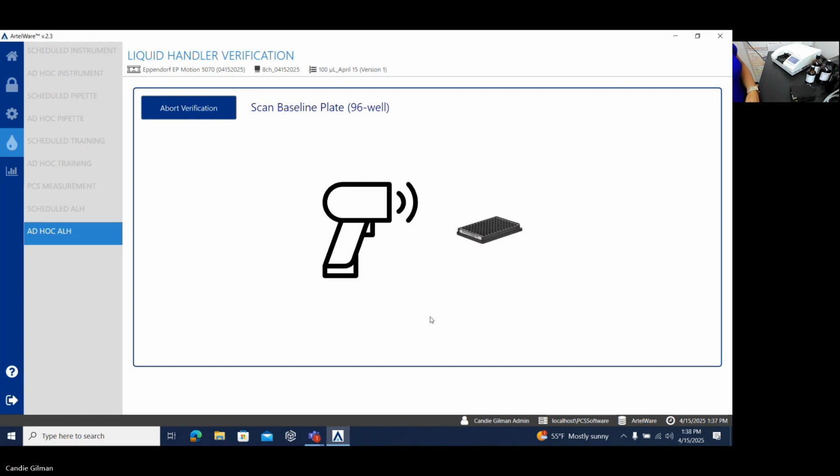Right. Next thing the system's asking me to do is scan the baseline plate. So let me go ahead and do that. I'm just going to run the baseline real quick for you today.